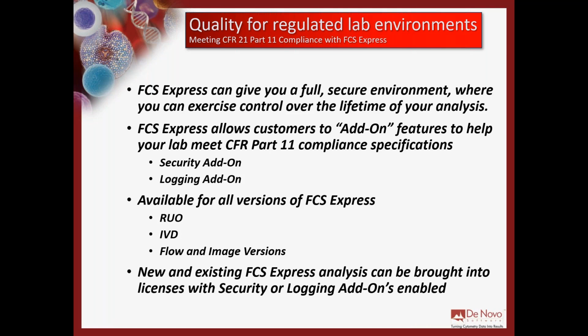That means the RUO version, the IVD clinical version, that can apply to the flow cytometry version or the image cytometry version. So it's applicable for any sort of analysis that you might be doing in any iteration or flavor of the software. And keep in mind that new and existing FCS analysis can be brought into licenses with the security or logging add-ons enabled. So if you've already done some analysis and you're looking at getting into a 21 CFR Part 11 compliant mode, you can take those analyses and move them over.